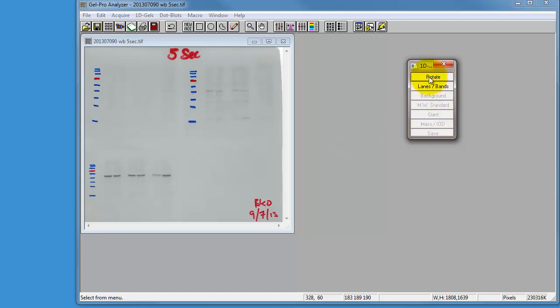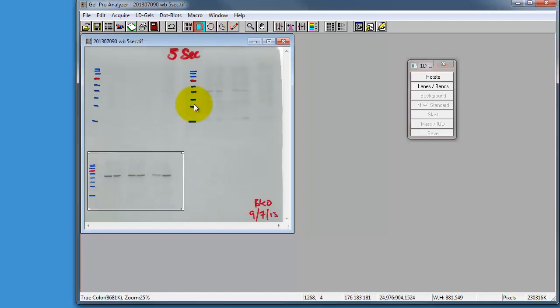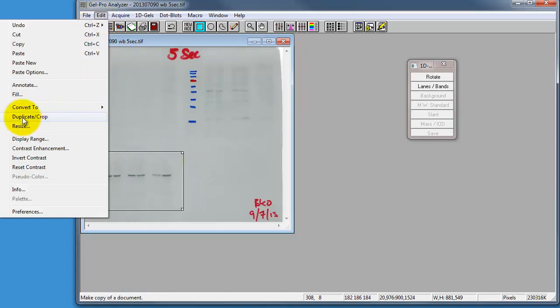The first thing it's wanting us to do is rotate it, but what I want to do before I rotate it is make sure that I'm only looking at what I want to look at. I only want to look at this gel down the bottom, not these other three. So I'm going to choose the rectangle tool, highlight the area I'm interested in, go to the edit menu, and do this thing called duplicate crop.